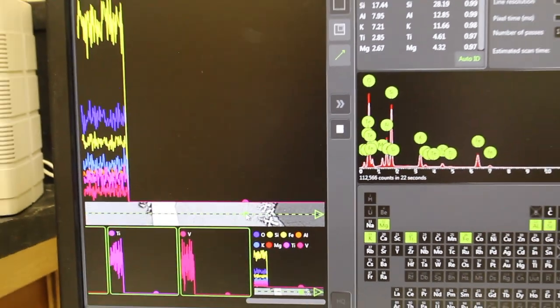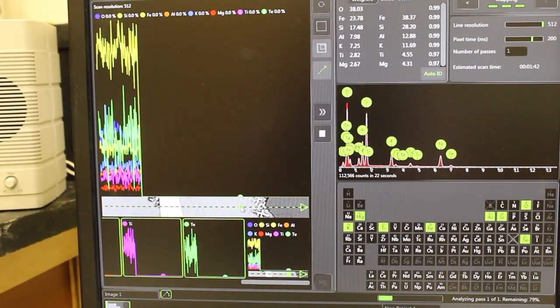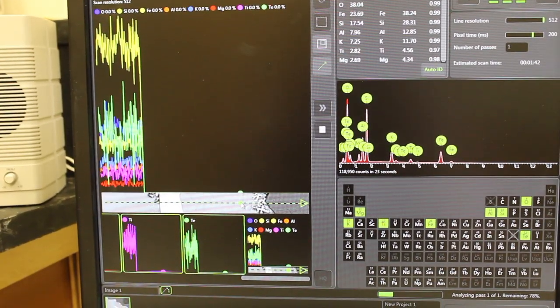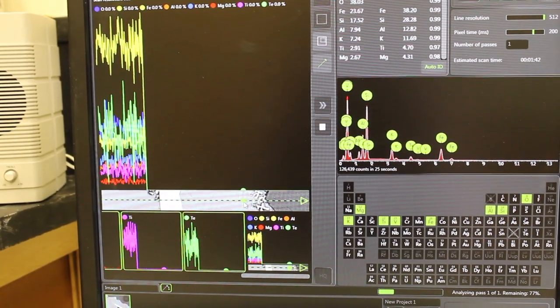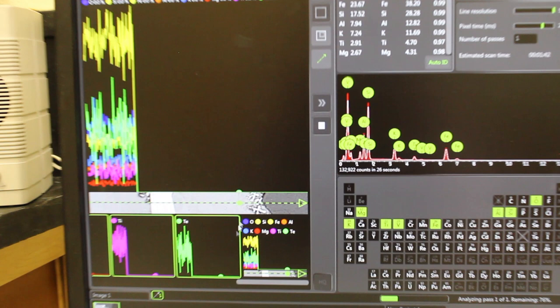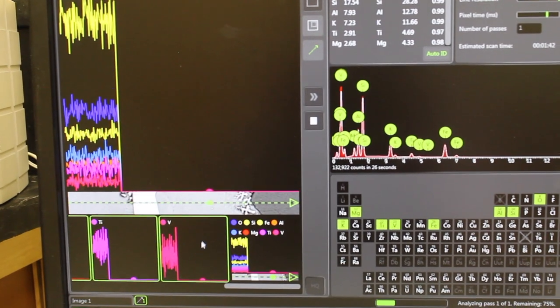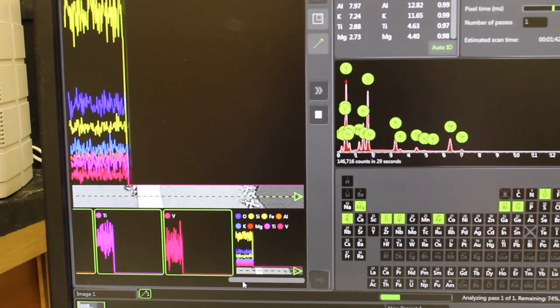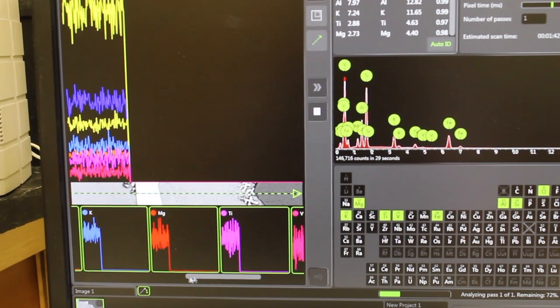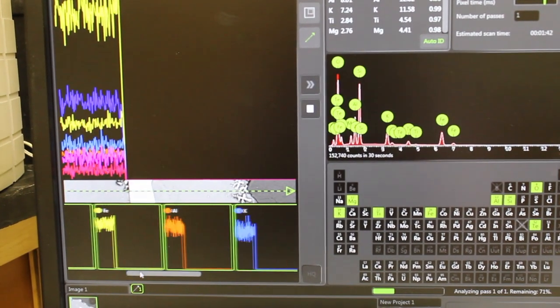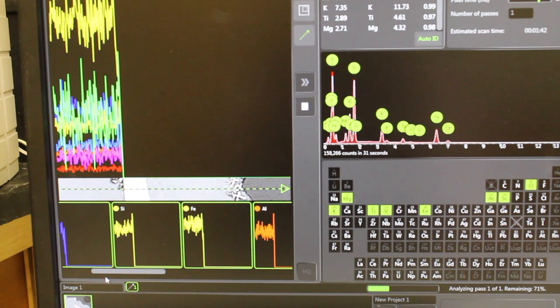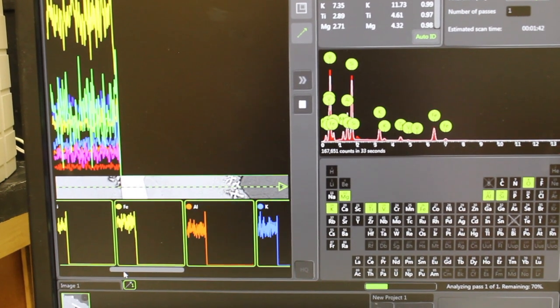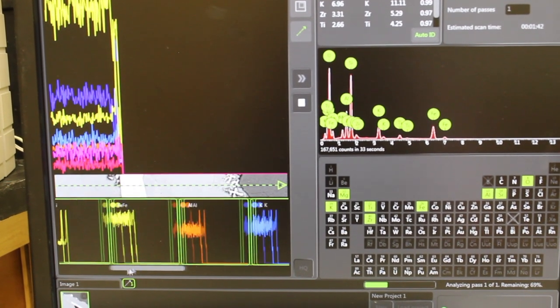The color codes, each different color is a different element, and they are marked just like the mapping down here at the bottom. You can scroll back and forth and choose which elements you want to map or not map.